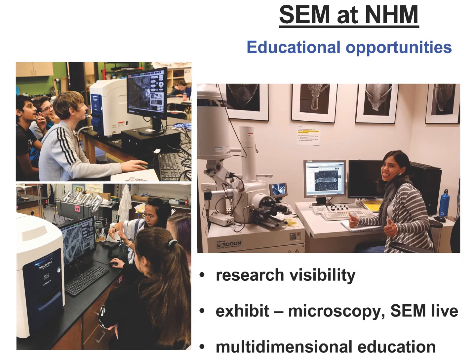And finally, we hope one day to have our research SEM on display so the public can watch it in operation by museum scientists. This will provide a unique opportunity for visitors to see an important facet of ongoing research.